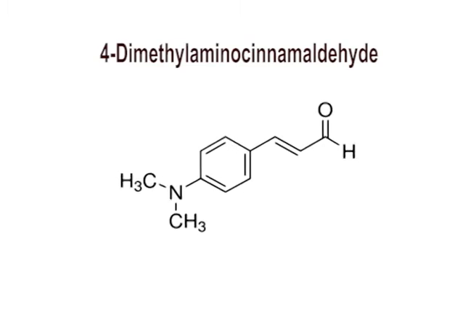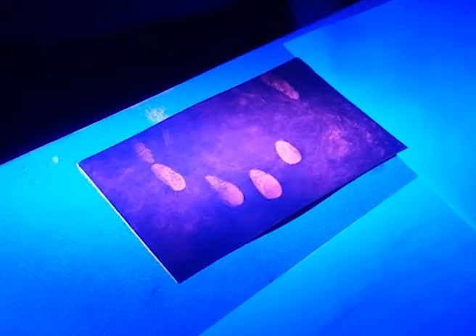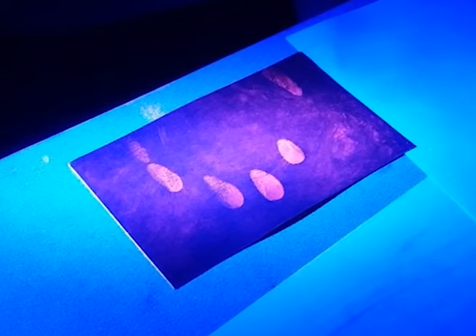The structure of 4-dimethylaminocinnamaldehyde is shown on your screen. The test solution is prepared by dissolving a mixture of 4-dimethylaminocinnamaldehyde, around 0.014 molar, and sulfuric acid, around 0.05 molar, in 350 ml of ethanol. The solution is further diluted by adding around 650 ml of ether. The mixture is sprayed on the article, and on drying, the fingerprints may be observed under ultraviolet or laser light.